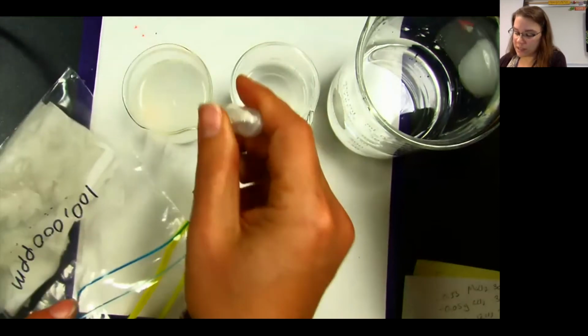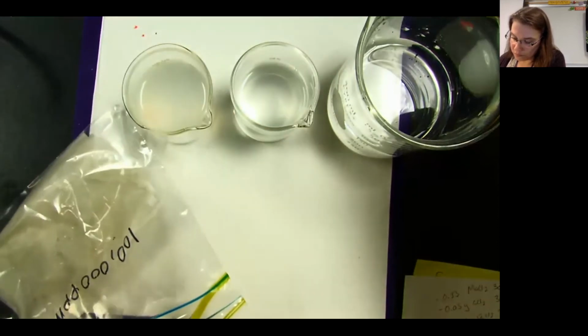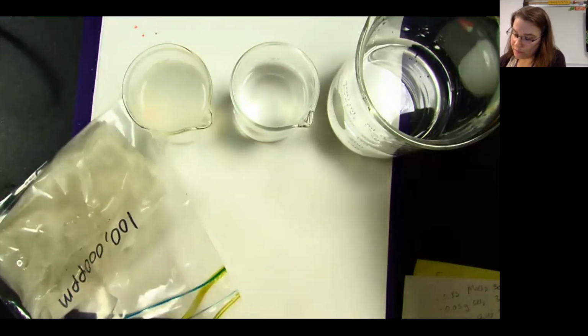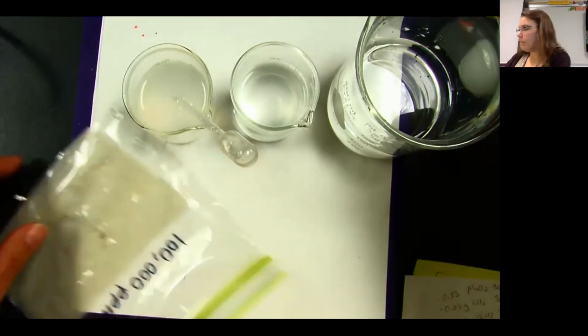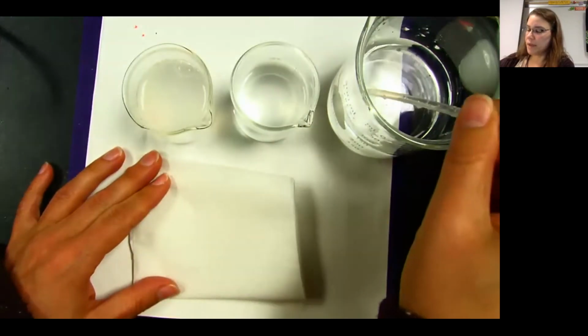I'm going to add just a little bit more water. And I should say this isn't pure water, this is my solution that I made. I'm going to make sure that this is sealed, and I'm going to lay it somewhere where it's going to get some light.